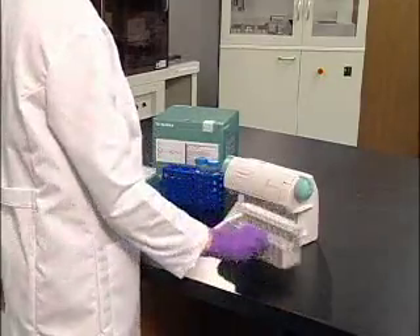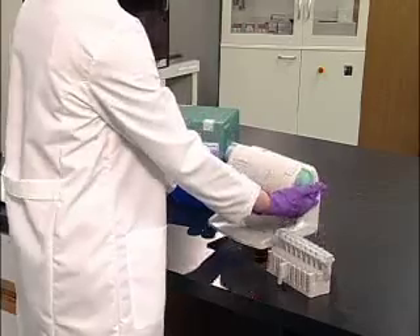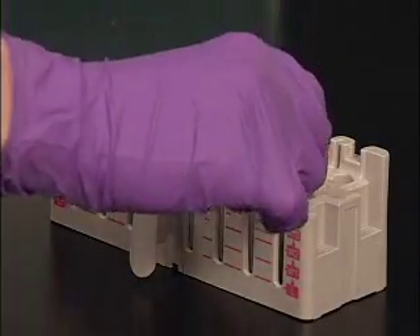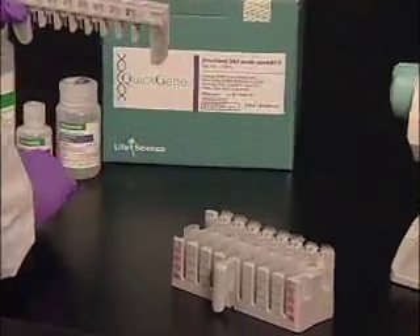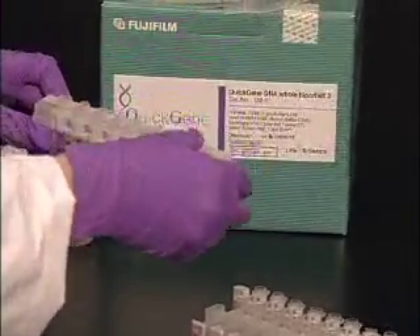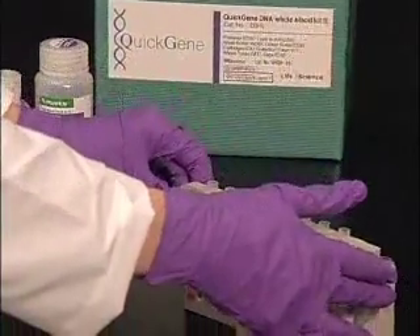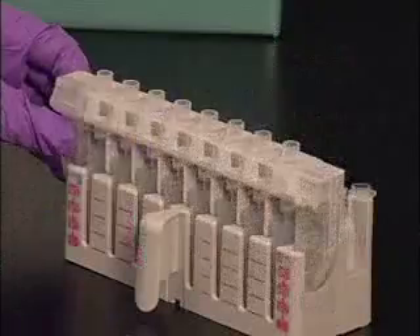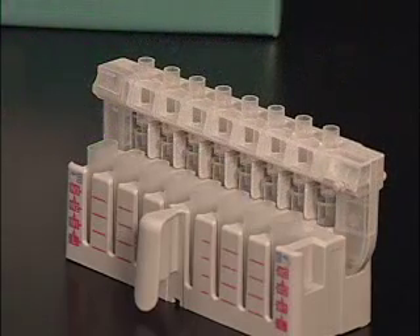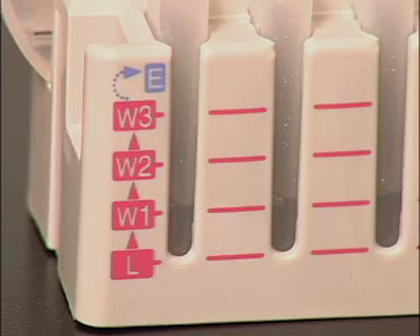To move the instrument from bench to bench or into the cold room, carry it by the handles on each side. The tube holder holds both the waste and collection tubes. The cartridge holder containing the sample lysate sits atop the tube holder and has two positions: the first is for washing, situated directly over the waste tubes, and the second is for the elution step, positioning the cartridges over the collection tubes. A nice feature of the tube holder is that the amount of solution in the waste tube acts as a placeholder, allowing a researcher to see where she's at at all times.